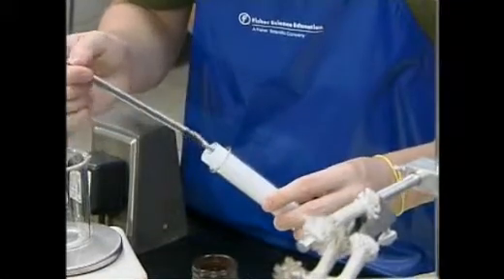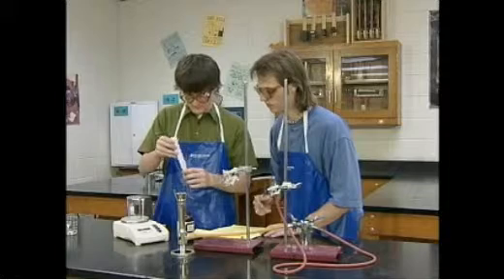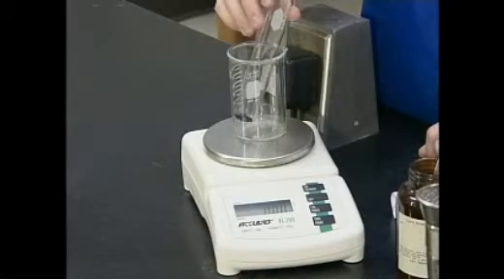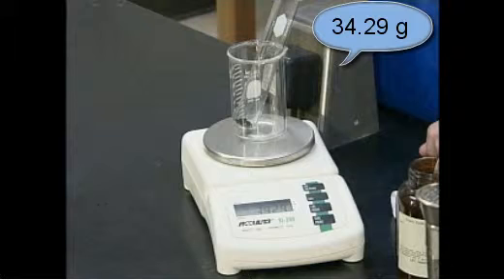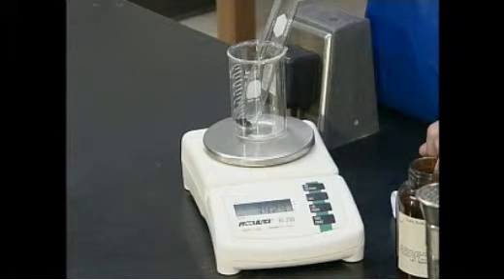Now that the students have added the copper oxide to the test tube, they are removing the paper. They find the mass of the test tube with the copper oxide in it to be 34.29 grams. Notice that they are careful to keep the copper oxide at the bottom and off the sides of the test tube.